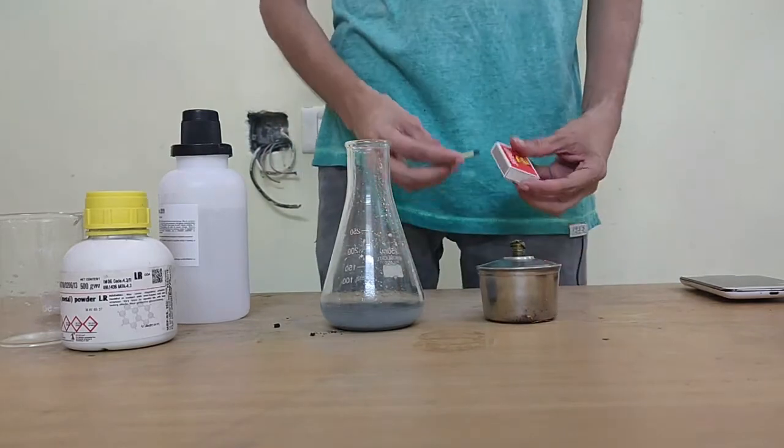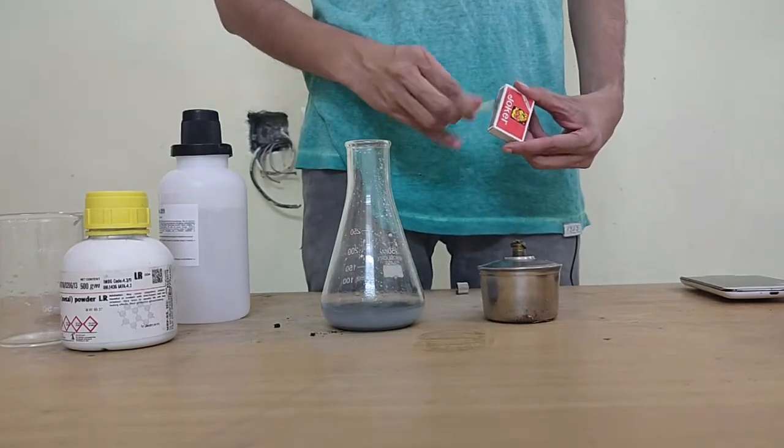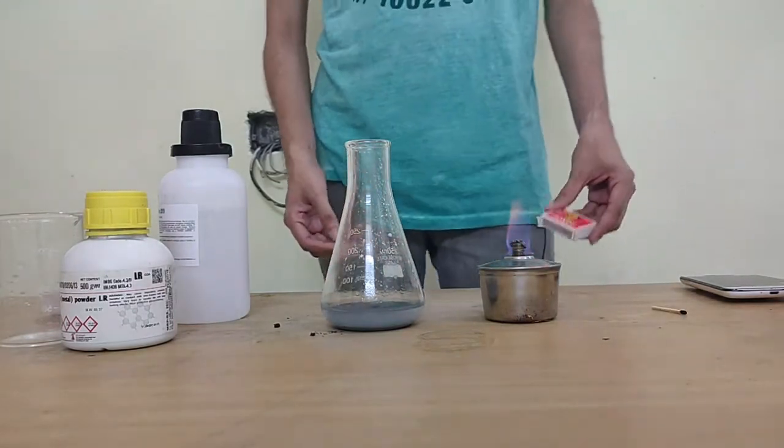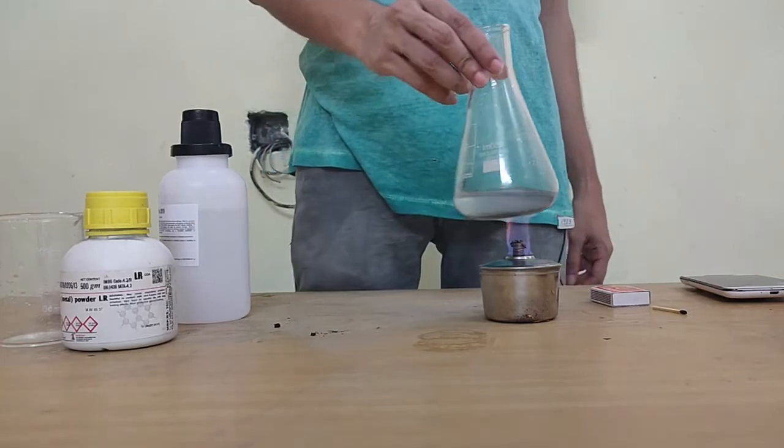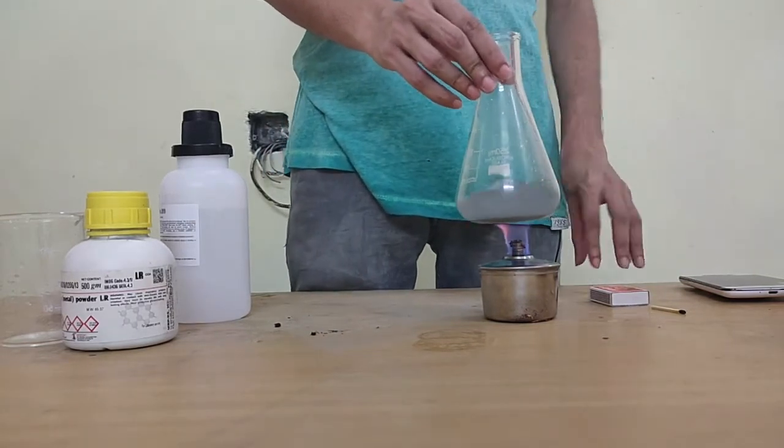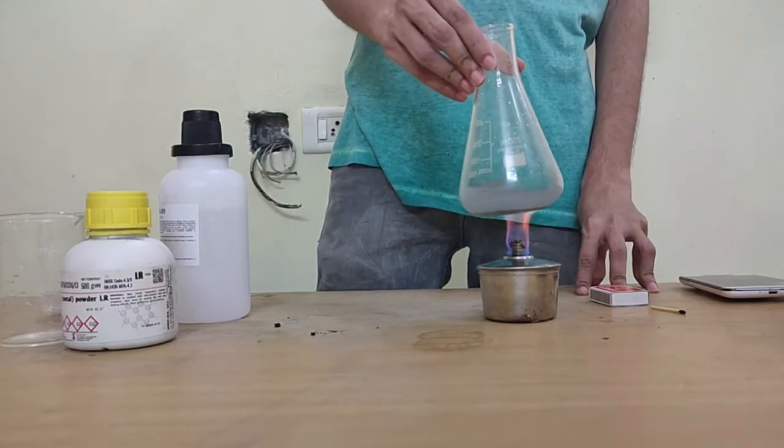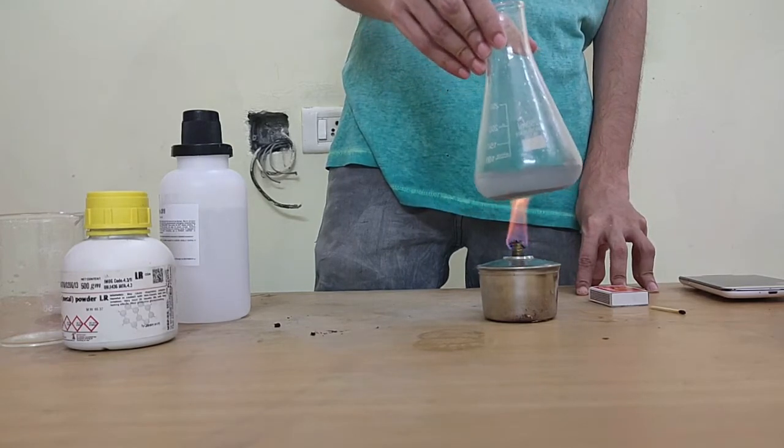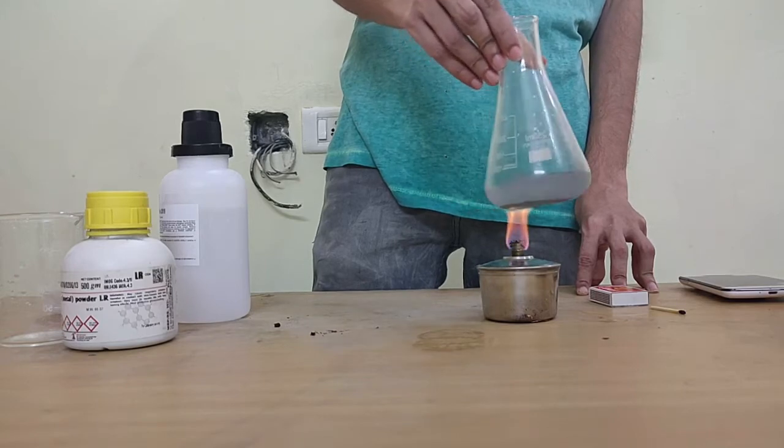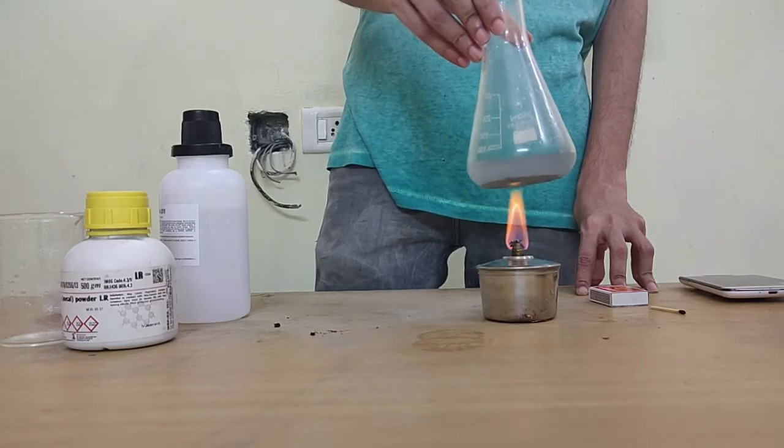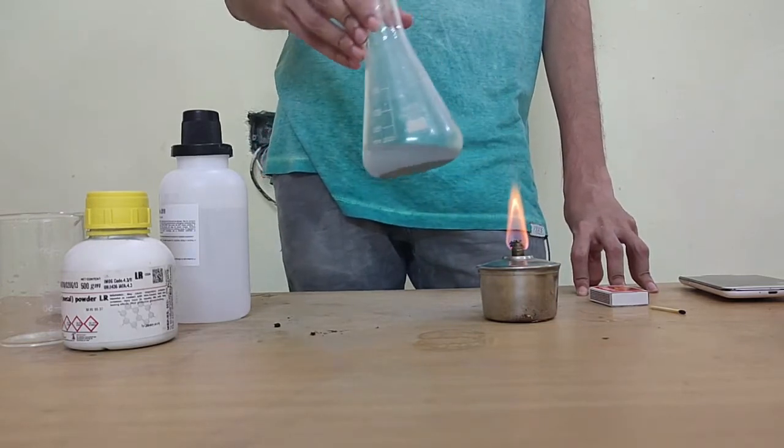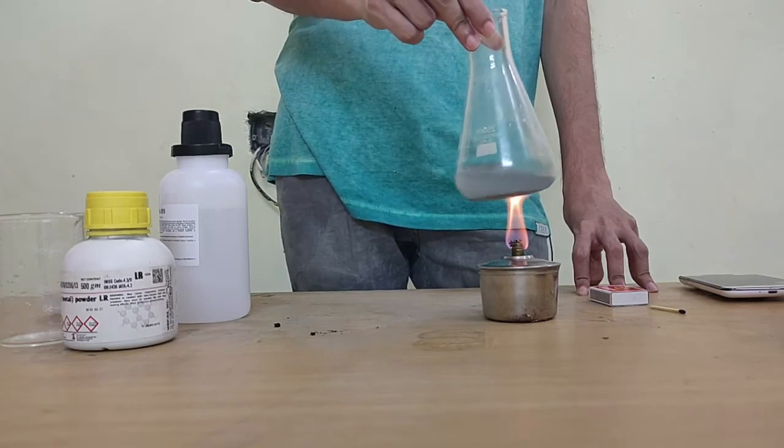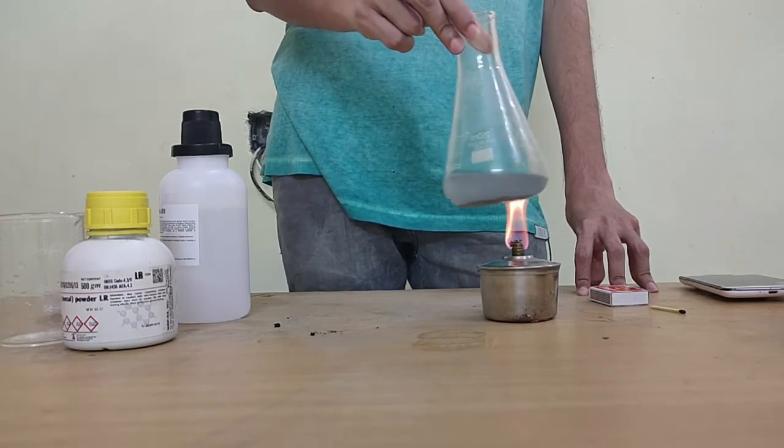Today I'll be heating this flask with the spirit lamp. Shouldn't overdo it because the flask is, after all it is glass. This is borosilicate glass by the way, you cannot just use any normal glass. Please don't try to do it on your own at home by using any regular glass. Borosilicate glass is heat resistant, it can handle heat, it won't crack so easily.